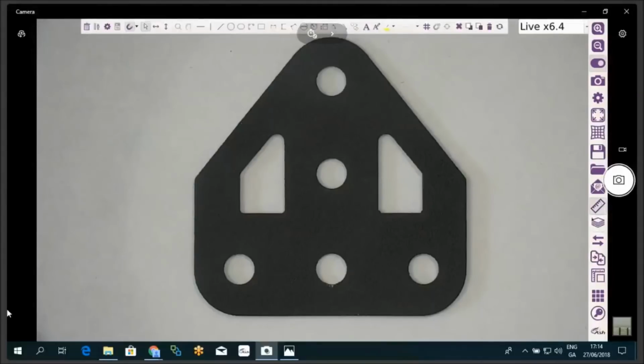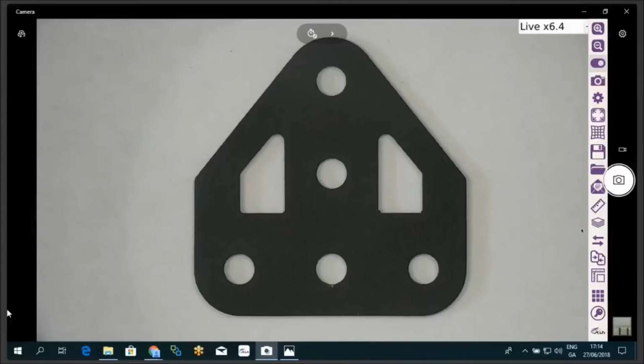And also with automatic measurement, there is a motorized stage option. So this means it'll do exactly what you just saw, but a motorized stage can actually move the part to the correct position on the camera. So again, the location of the part on the stage is actually stored in the measurement file.